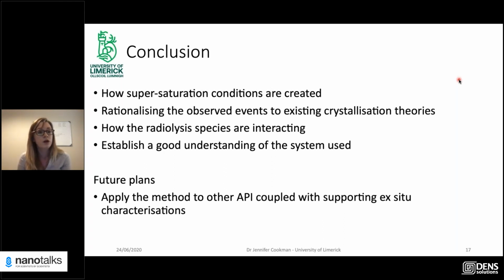So next, what I'll be doing is to apply this to other materials, and even in terms of the concentration range. For example, flufenamic acid, as I said, 50 millimoles was ideal for the crystallization experiments, but that was 60 times lower than the classical supersaturation. Whereas for another material, I'm using 150 micromoles. So the concentration range is going to change a lot, and trying to hone in that range is quite difficult, but we'll get there in the end.